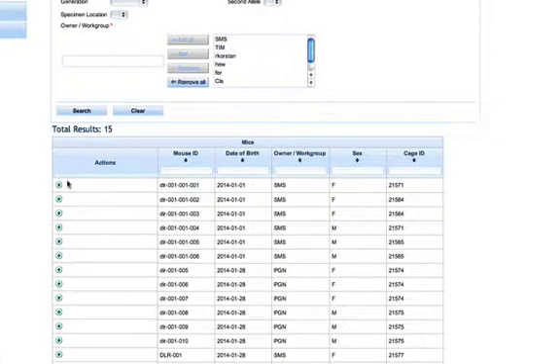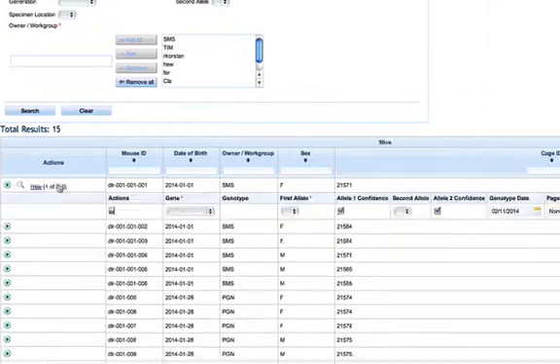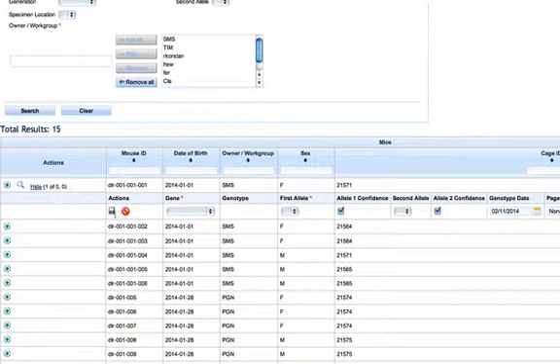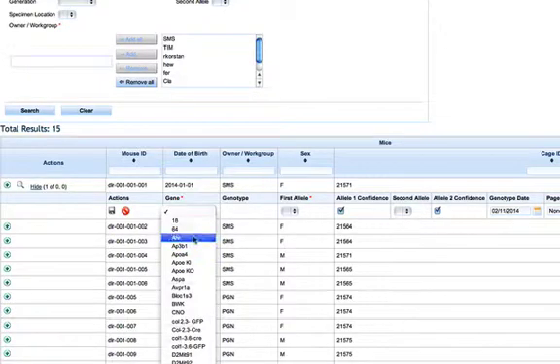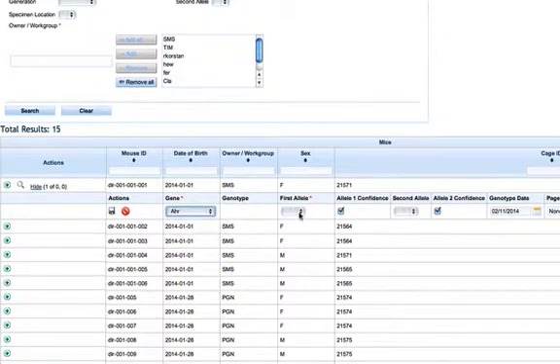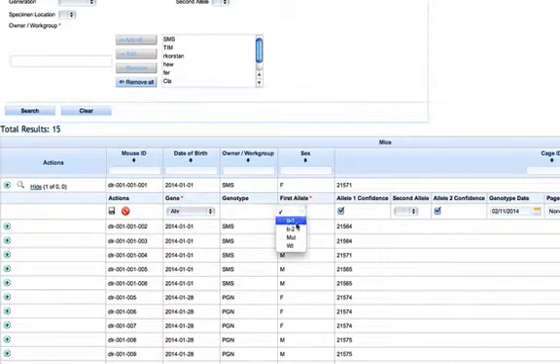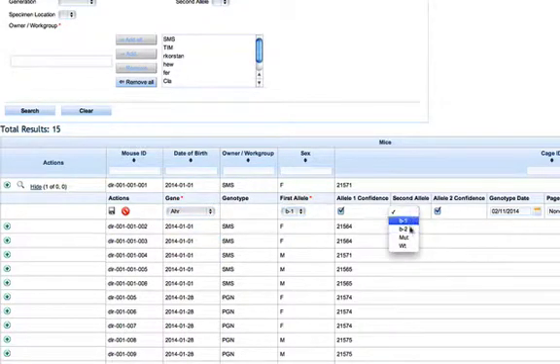Click on the green plus sign in the actions column, select a gene and a first allele and second allele.